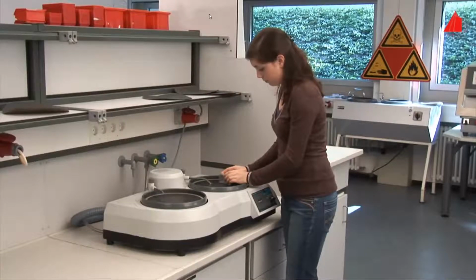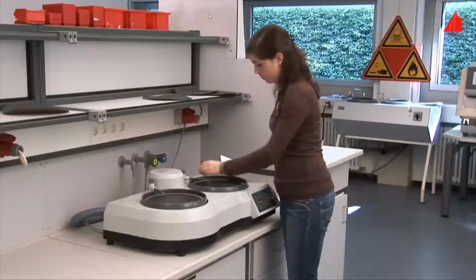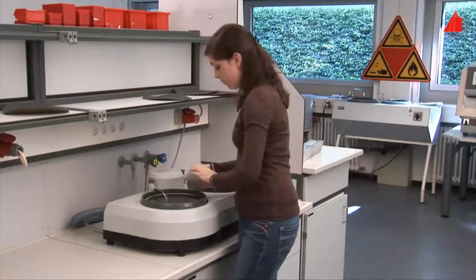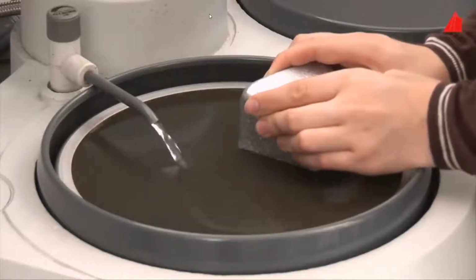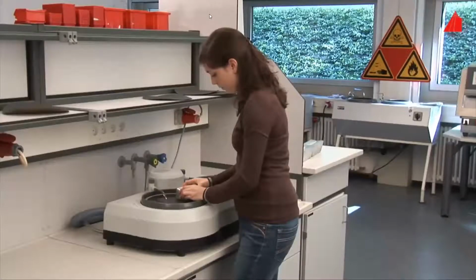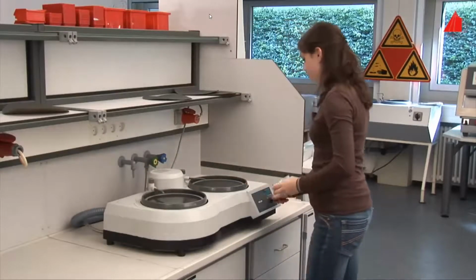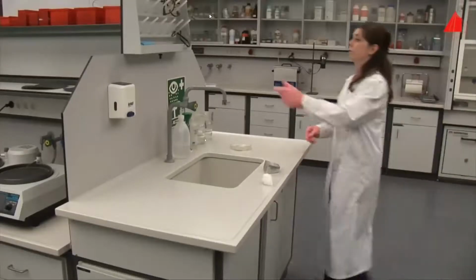After the first grinding operation with coarse-grained paper, the material tester rotates the sample by 90 degrees and grinds it once more, this time with medium-grained silicon carbide paper. Here again, she uses sufficient flushing with water. This keeps the sample cool and prevents the abrasive paper from being loaded with material particles. Now, a flat, medium-ground surface has been created, but apart from the grinding marks, nothing special can be seen.